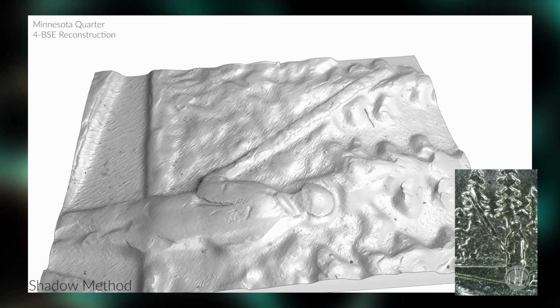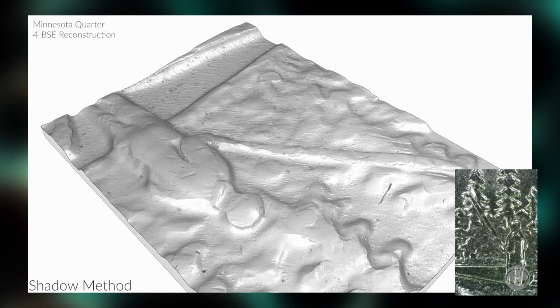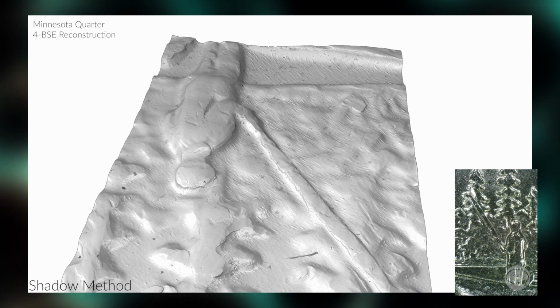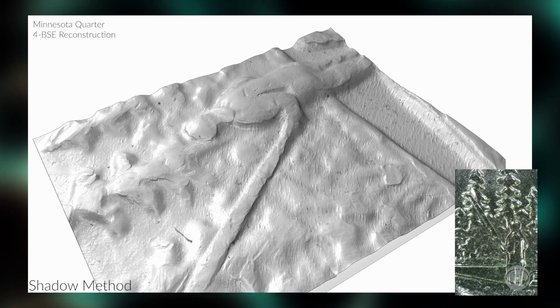Now, I suppose before you buy software to do this, that should be a question that you should ask. How do you calibrate the Z height in these shadow reconstructions? What it likely involves is putting a calibration sample into your SEM and taking images of it under the exact same conditions you took the images of your sample. You'll want to match the working distance and the voltage and possibly also the condenser lens and aperture settings. My experience has shown me that this makes the data much more accurate.